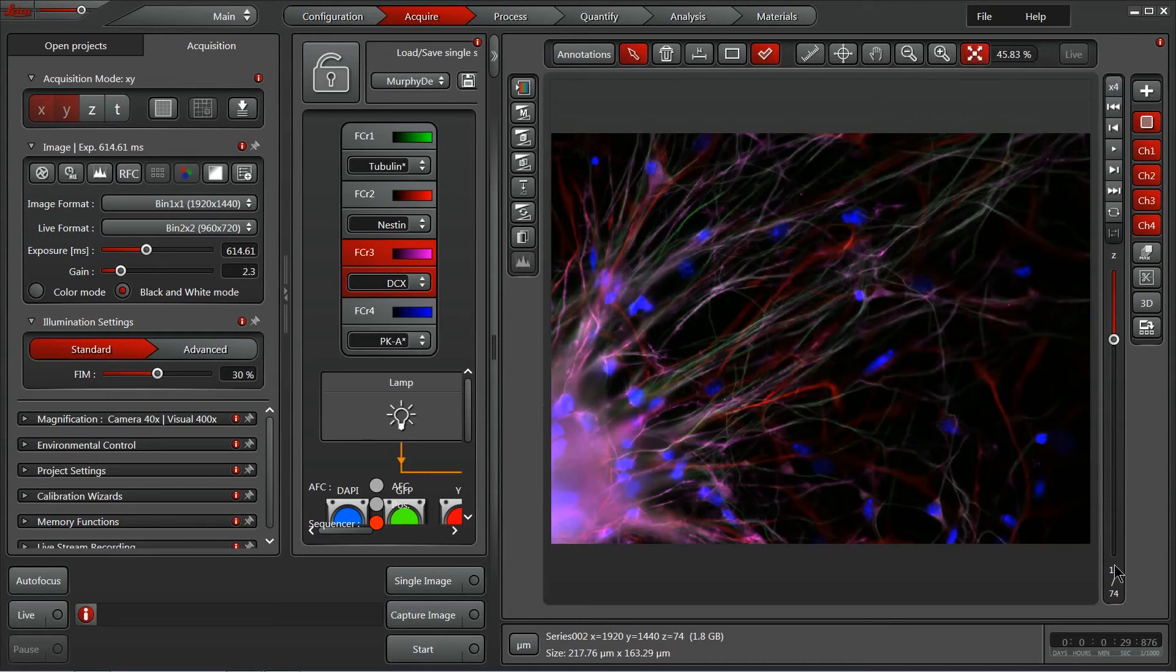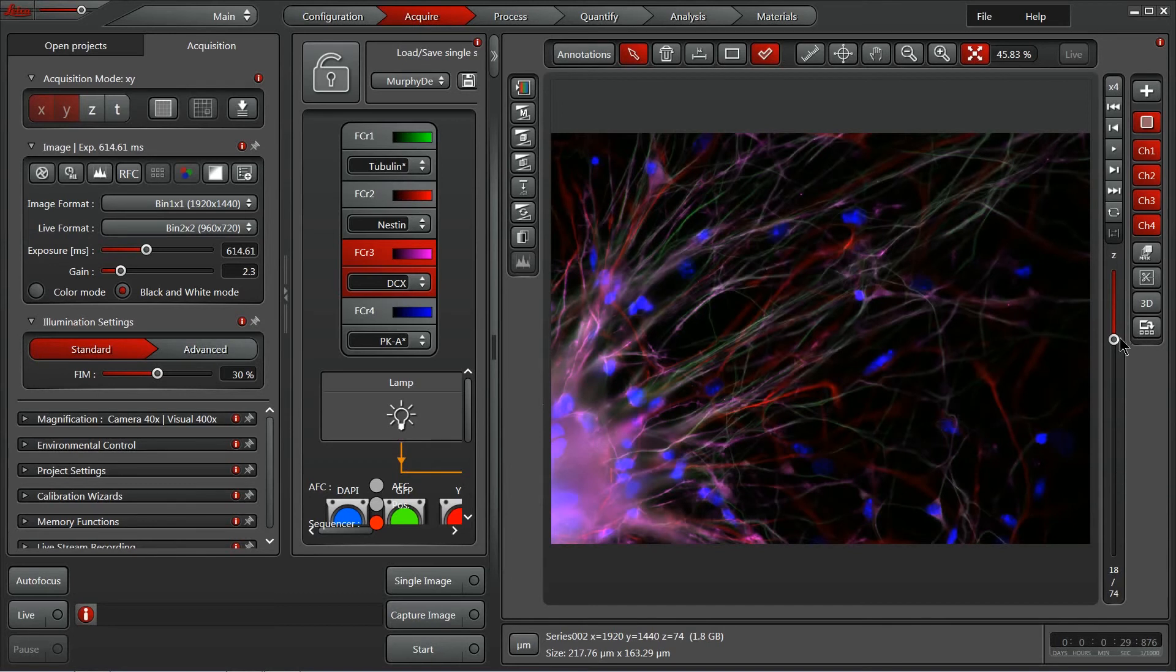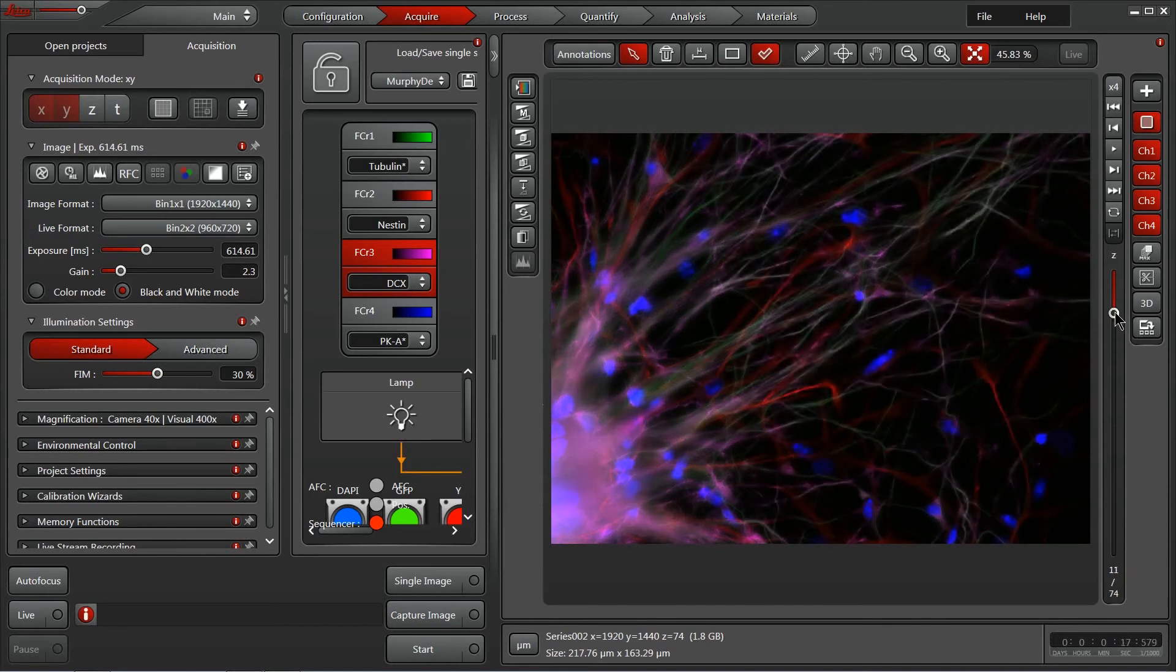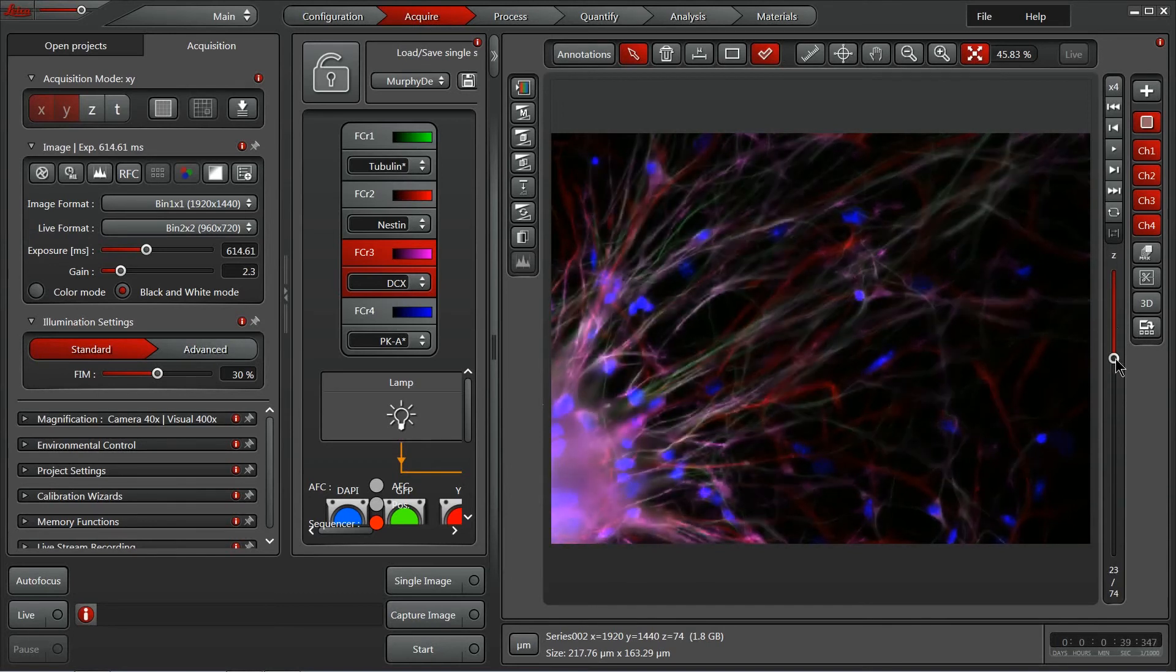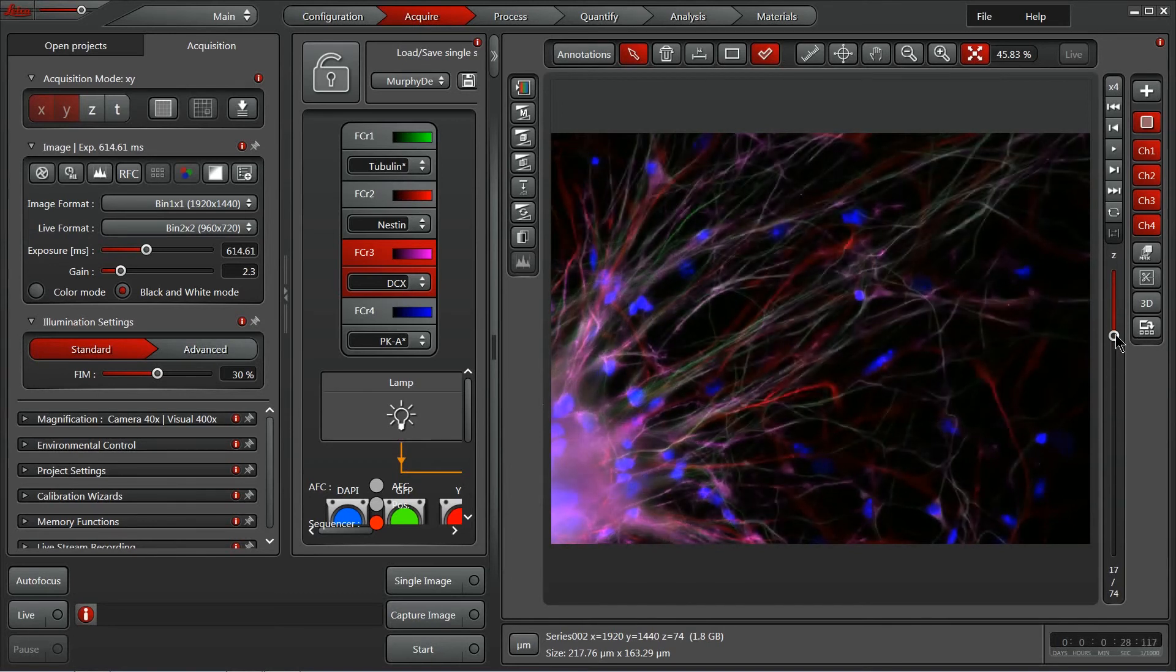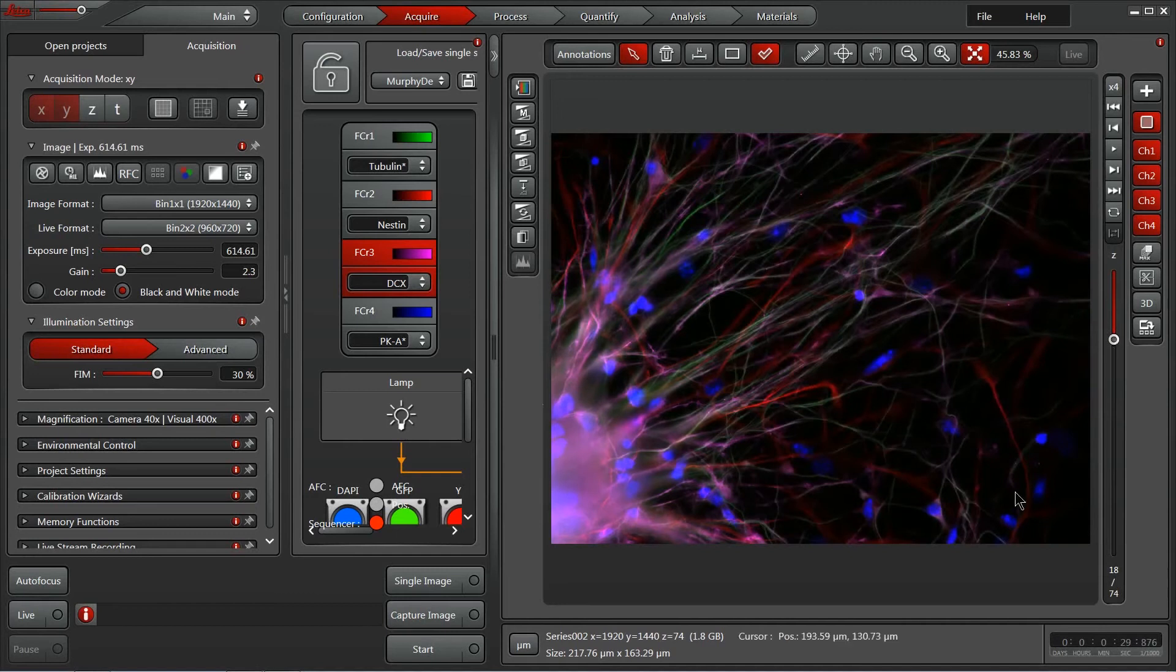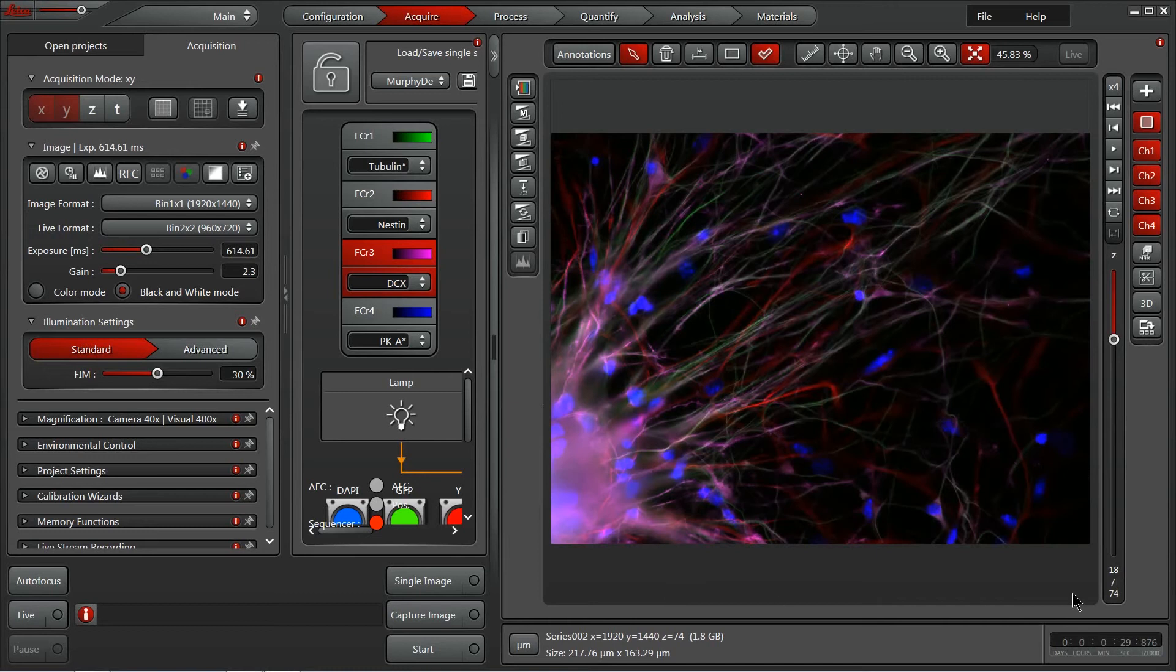Around the image, we'll have different elements to control the dimensional information. In this case, I've got a Z-Stack loaded, so we have our Z-Stack, or our Z-Information controls here on the right side. If we had a time lapse or multiple stage positions, those would be available here on the bottom.